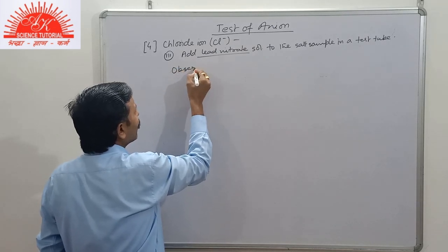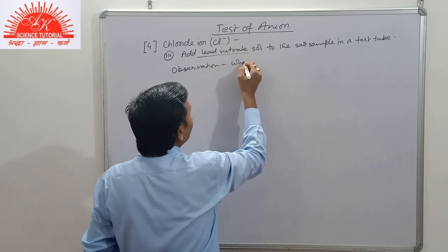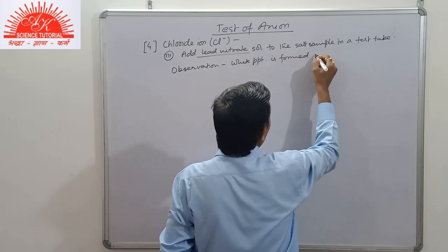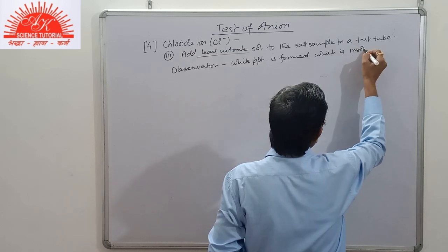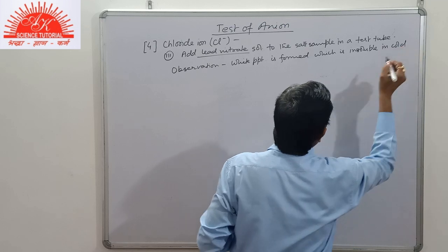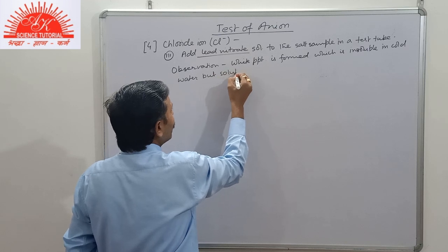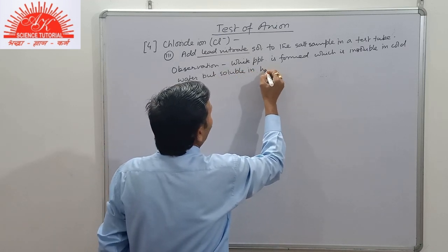Observation: a white precipitate is formed which is insoluble in cold water but soluble in hot water.